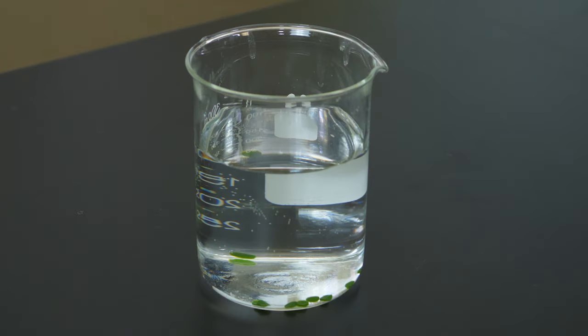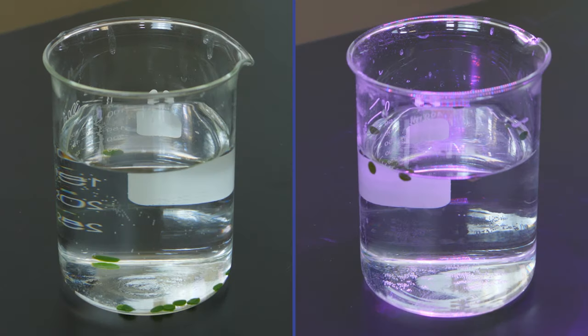Now, let's look at our control group. Notice that all the chads are still at the bottom of the beaker. Since this group was not exposed to light, photosynthesis did not take place, and no oxygen was produced. This experiment demonstrated that light acted on the chads in the test group to produce oxygen.